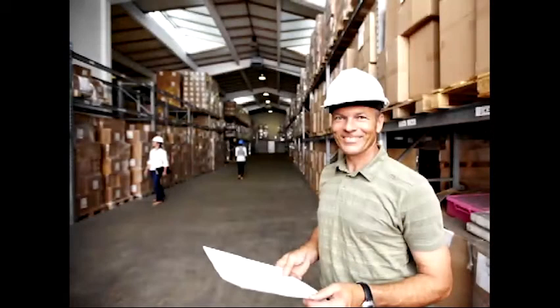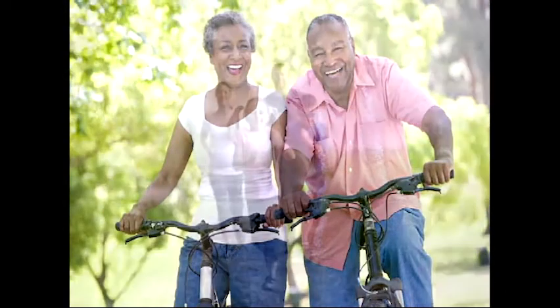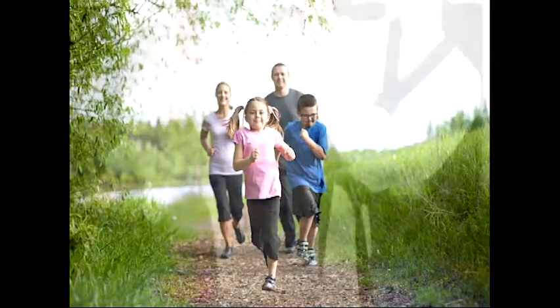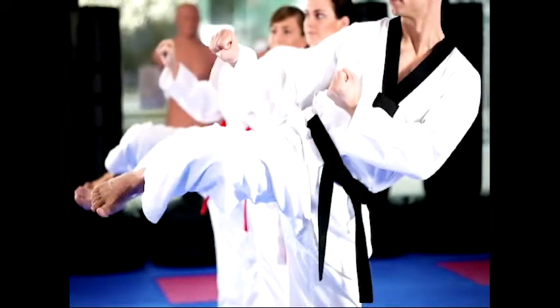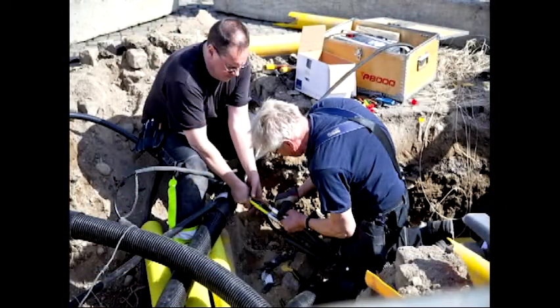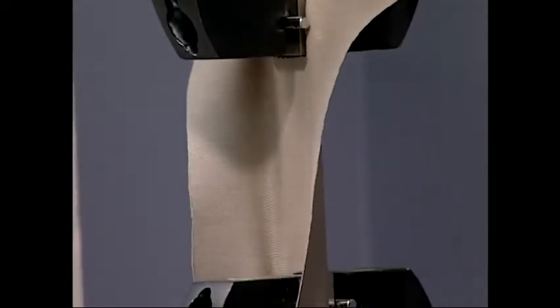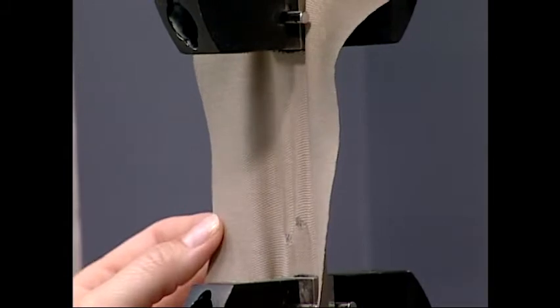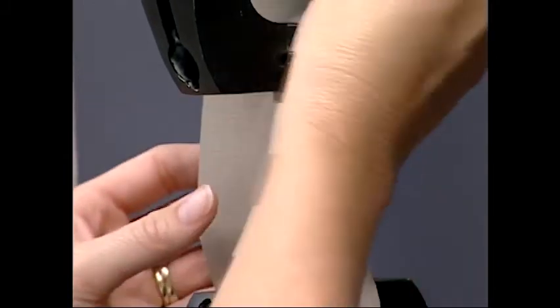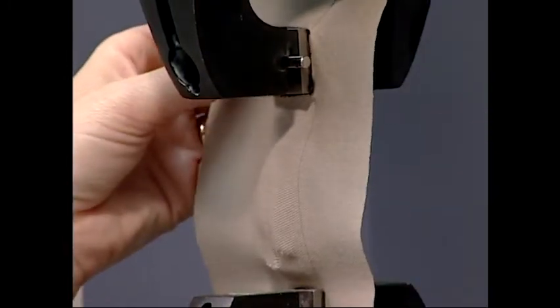Textile and apparel products must have some level of durability to ensure value to the consumer. Durability testing is designed to quickly measure how a product might perform without subjecting the product to numerous cycles of wearing and consumer care. Various testing methods are used to predict the level of durability in both a quick and accurate manner. These tests subject materials to physical stresses that incorporate pulling, abrasion, pilling, snagging, or other forces that will identify the weakest components of the product.